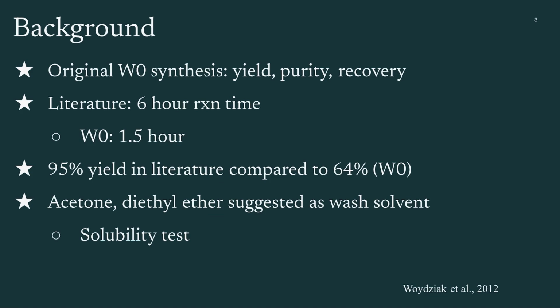The literature also recommended using acetone and diethyl ether as wash solvents. So in addition to modifying the reaction time, we also tested whether using cold acetone or ether washes during the recovery step would improve the purity without dissolving the product.